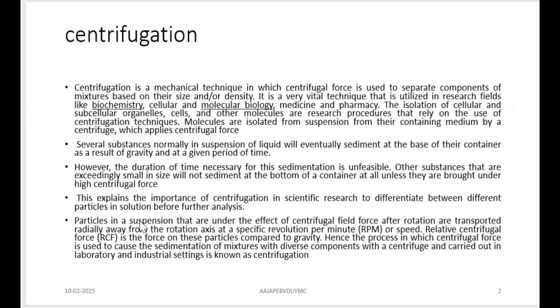Now, when you are talking about particles in a suspension, you can imagine the effect of centrifugal force. There are two types, centripetal and centrifugal. Fugal is going away from the center and centripetal is towards the center. We want the force which is working away from the center, that is centrifugal force. So the particles will be moving outward, then they slide down the centrifuge tube and settle at the base. That is how it works.